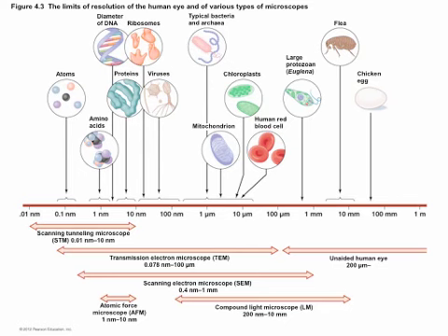Scanning tunneling microscopy is actually measuring quantum effects, which happen over very, very small distances, like 10 nanometers, which is the size of a ribosome or a protein, much, much smaller than a cell, or even the smallest organelles. That's so big a scanning tunneling microscope can barely see it. It's a huge field of view. Scanning tunneling microscopes can go down to visualizing single atoms and below.